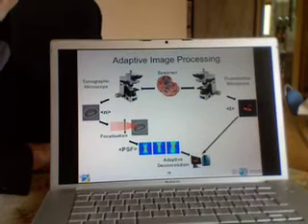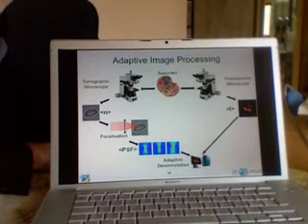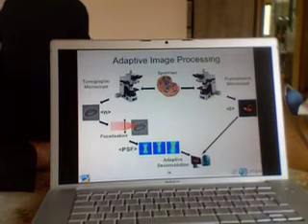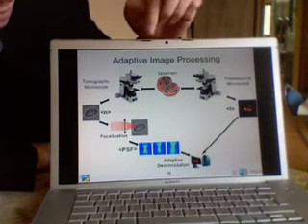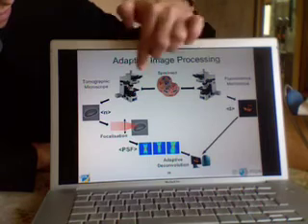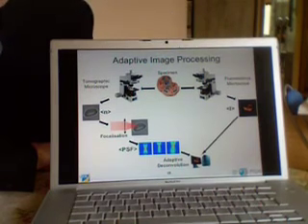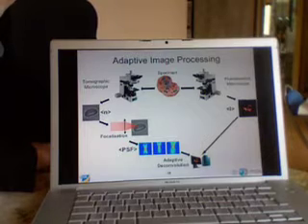But this image can hardly be used by the biologist and must be pre-processed in order to be correct. So what we have proposed is this tomographic approach, which measures the index of refraction distribution within the specimen.